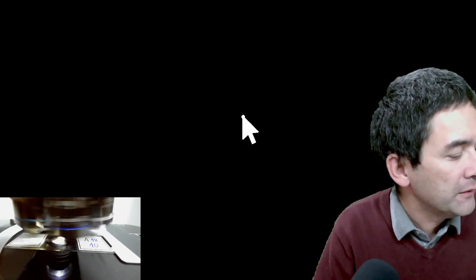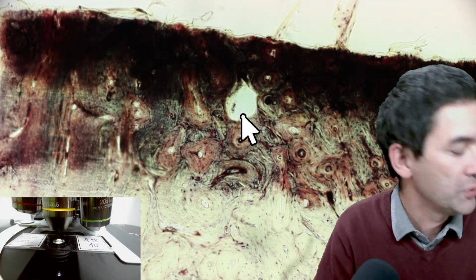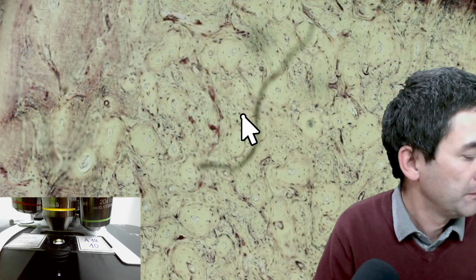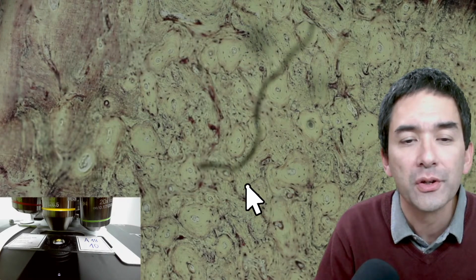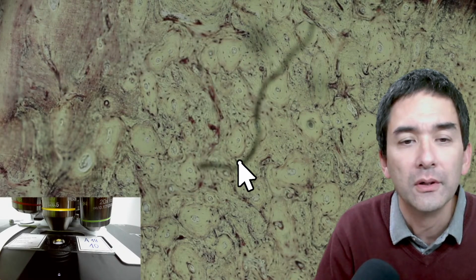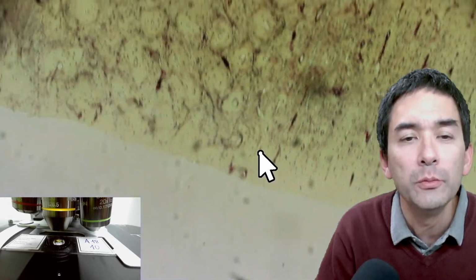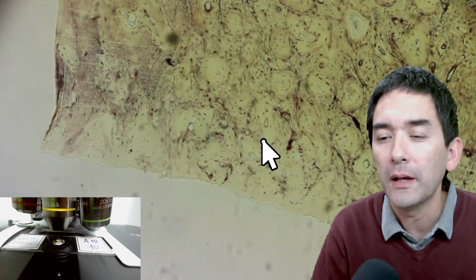So let's go down with the magnification a lot, and then I'm going to move on, because I would have plenty of slides to show you as well. But I think when we get this overview here, then we can actually see this repeating structure, where you always have those circular arrangements, and always blood in the center. This seems to be some kind of dust fiber here. So this is indeed a human tissue, according to the label. So let's move on.